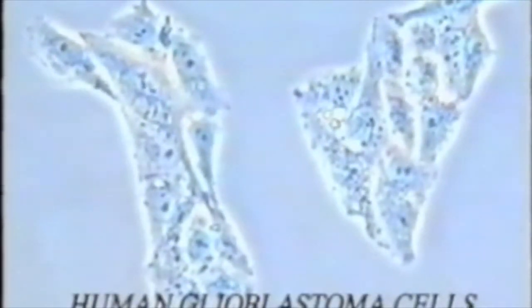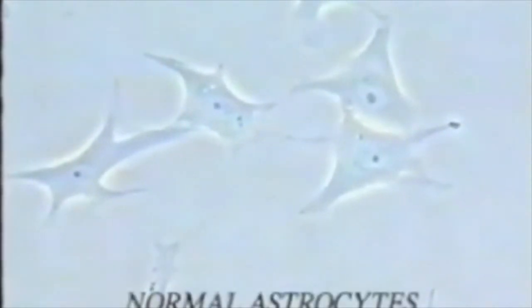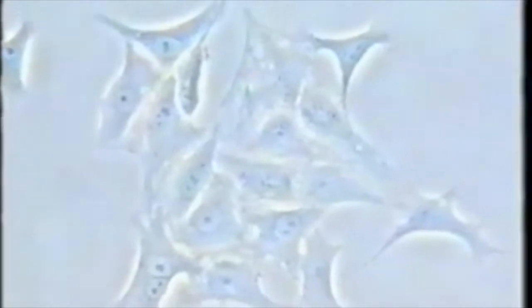We shall see the effect of PB100 in vitro on two malignant human cell lines and on their normal counterparts. The U251 cell line is derived from a human chemotherapy-resistant glioblastoma, a highly malignant brain tumor. Normal MPF astrocytes are typically star-shaped. The G361 cell line is derived from a human malignant melanoma. CCD 974 SK cells are normal human fibroblasts.